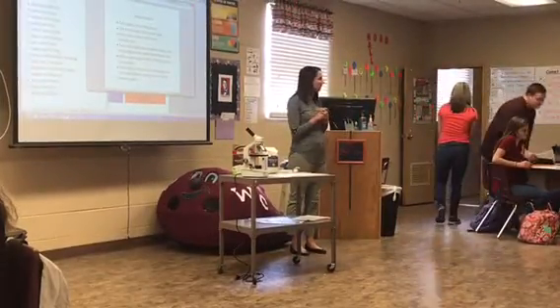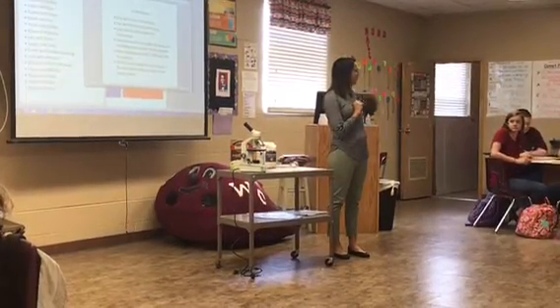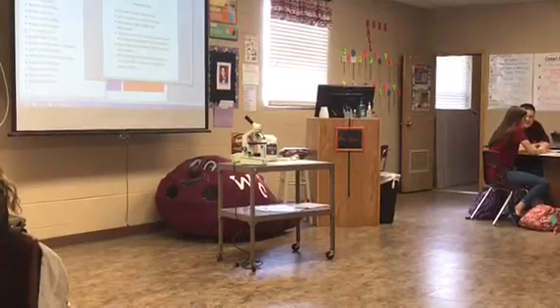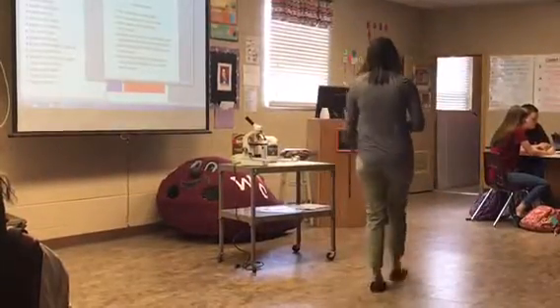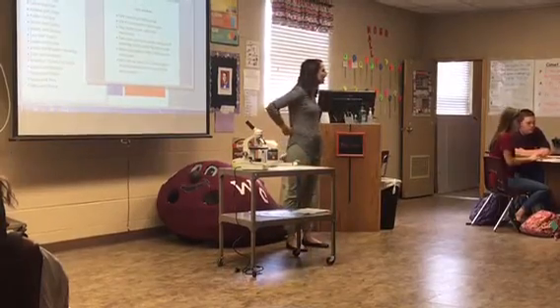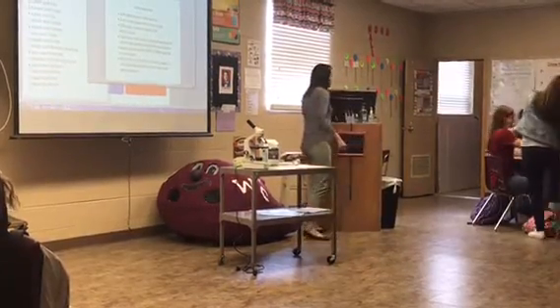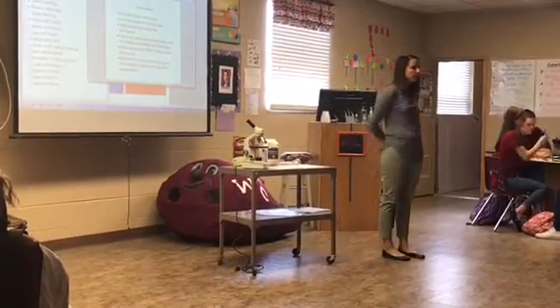Now I need one person from each lab group at table 1 to go get a microscope. I'm going to turn the lights down. Alright, table 2, one person from each lab group, get a microscope. Go ahead and plug them in. Take the microscope covers off. Make sure the lamp works. Alright, table 3, one person from each lab group get a microscope.